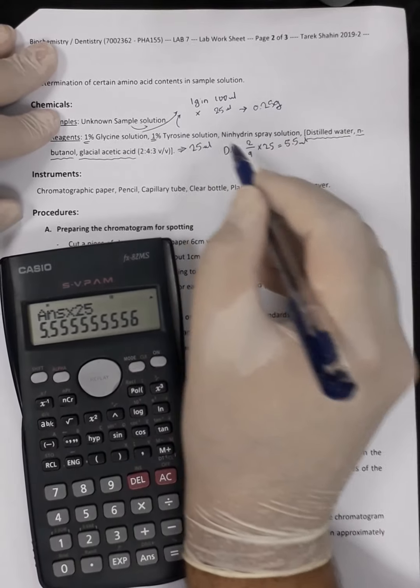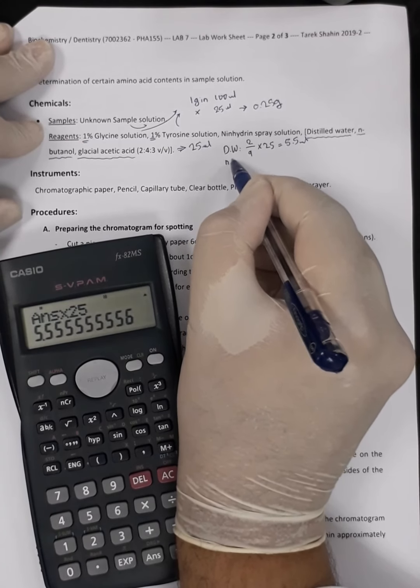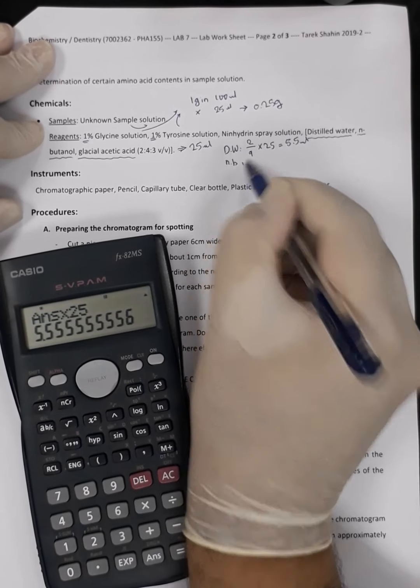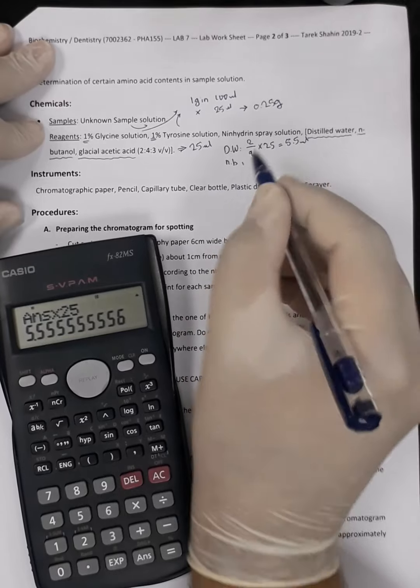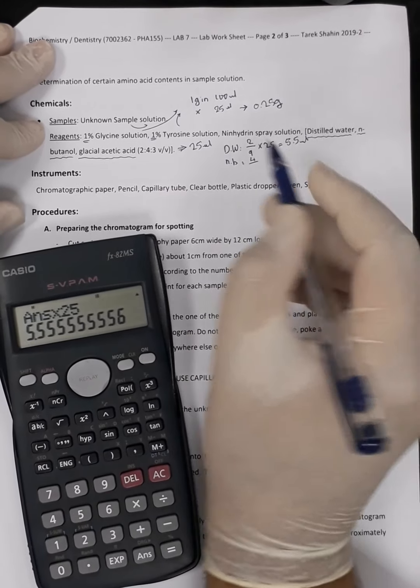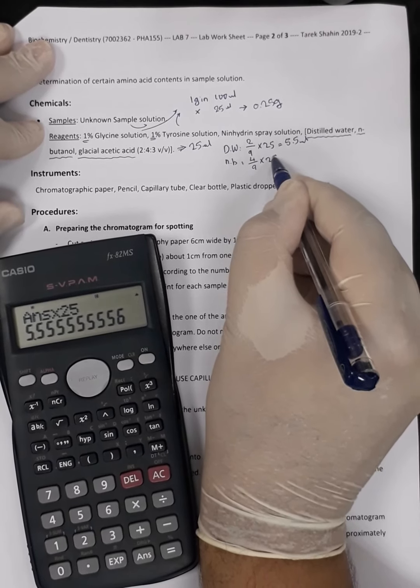Okay. Now we want to know the volume of N-butanol, the second chemical. We use the same technique. We will find out the number of parts of butanol. It is 4, divided by the total number of parts, which is 9, and multiplied by 25.